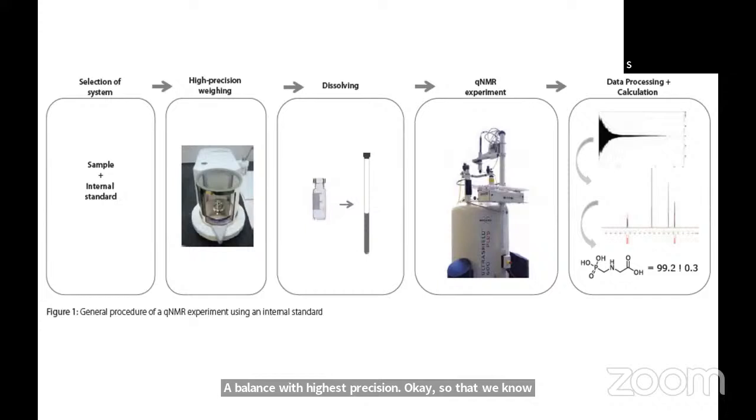Just like in the case of the Indian Pharmacopoeia, let us say you are performing an assay of diphenhydramine, then what is written over there? Take 20 tablets, triturate them, and then take 500 milligrams equivalent diphenhydramine powder. Okay. So tablet powder is weighed, and then we go for analysis. Okay. For weighing, we use a precision balance.